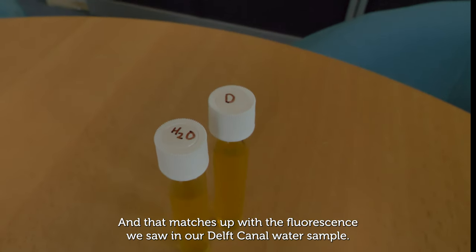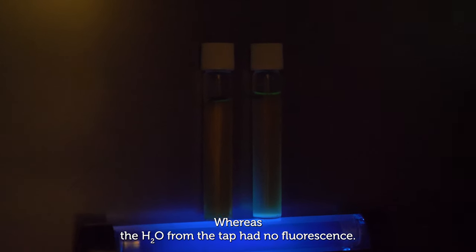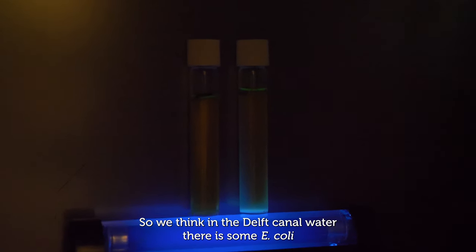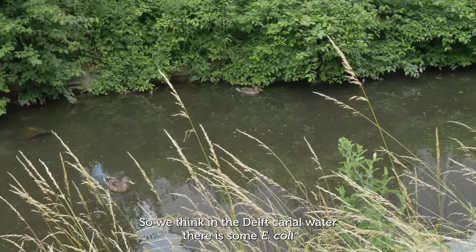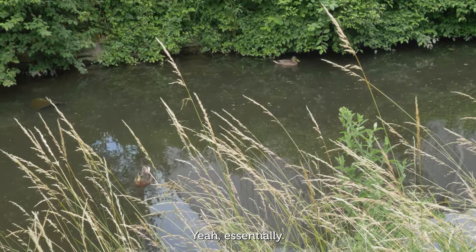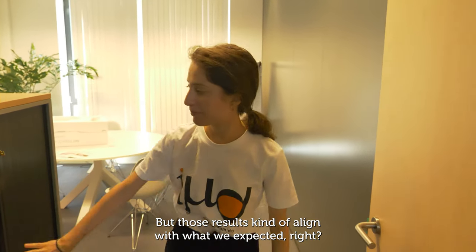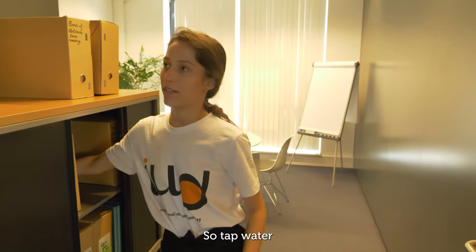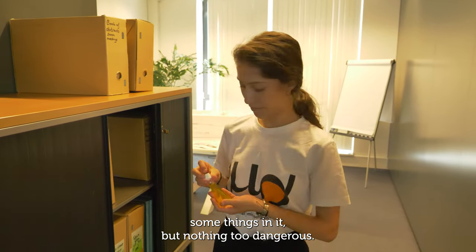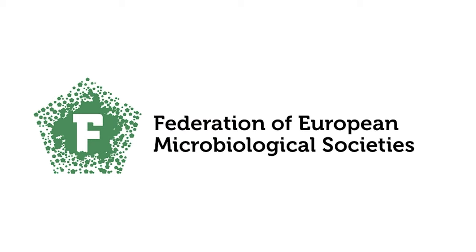The blue colonies are E. coli from the canal water, and that matches up with the fluorescence we saw in our Delft Canal water sample, whereas the tap water showed no fluorescence. So we conclude there is some E. coli in the Delft Canal water — we should not drink it. These results align with what we expected: tap water has nothing too dangerous, while canal water has lots of stuff, some of it potentially dangerous.